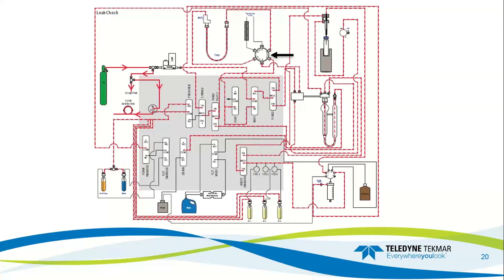If all of the subsystems pass the leak check but the whole system continues to fail, the leak can be isolated to the following areas: loose fittings in the six-port valve, a potential cross-port leak in the six-port valve, the trap fittings — tighten those if you recently changed the trap, or since the trap is heating and cooling constantly those might loosen — or the fittings on the moisture control system.